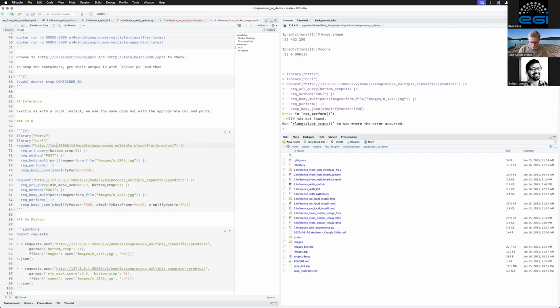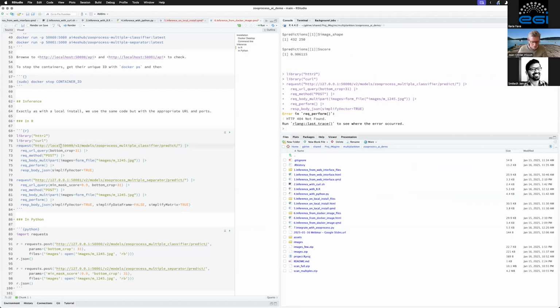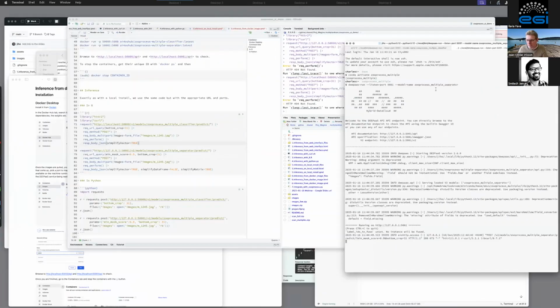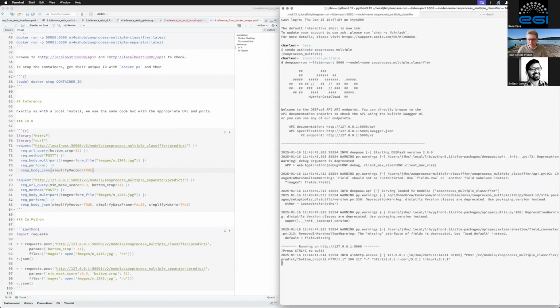Oh, maybe because I have... oh, that's strange, because it received the request. So... okay, that's the point of live demos, is that at some point they fail. But it should work. Okay, maybe I have too many things running at once, so let me kill that.